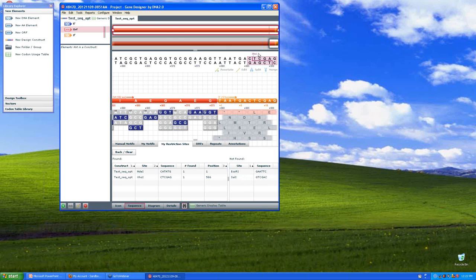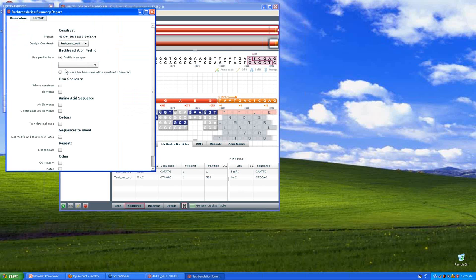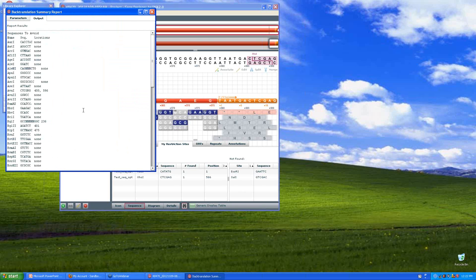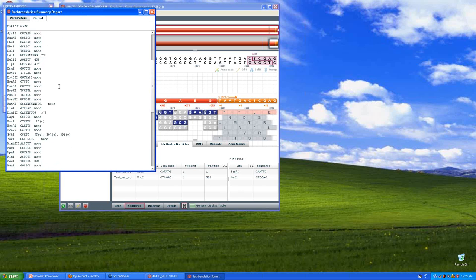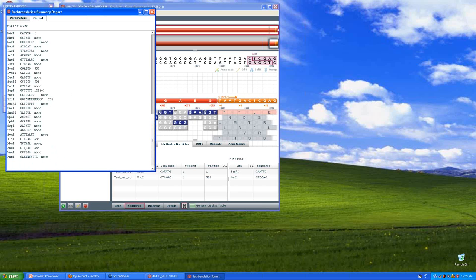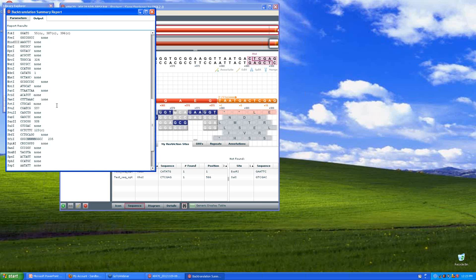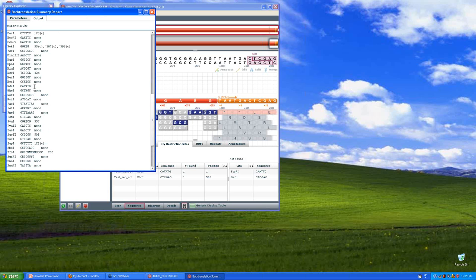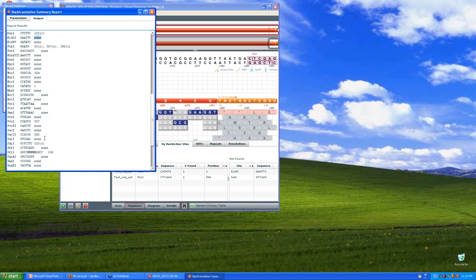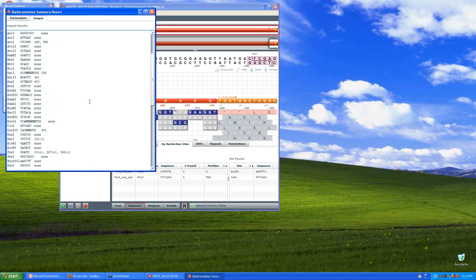Another way that you can get this information in more, maybe more of a text format is, again, go to Reports, Back Translation Summary Report. And if you just click on this button here, List Motifs and Restriction Sites, you'll get a list of many DNA restriction enzymes and the frequency and position of the cuts. So again, if I go down to XHO1, there's a single cutter at 586. And ND1, there is a single cutter at position one. And if I go to ECOR1, there are none. And the same would be true for SAL. So that's a quick way that you can check on the restriction sites.